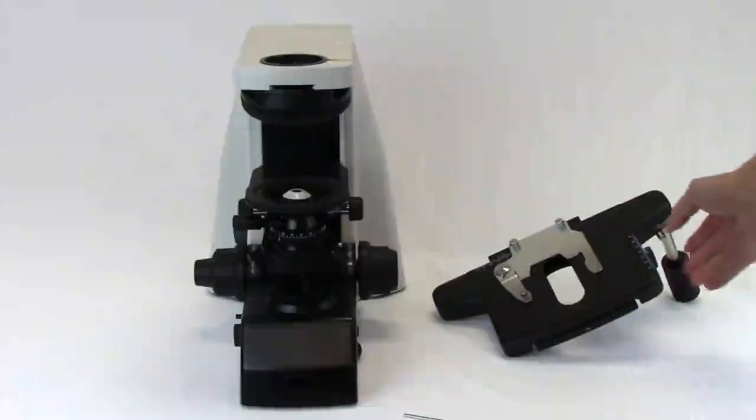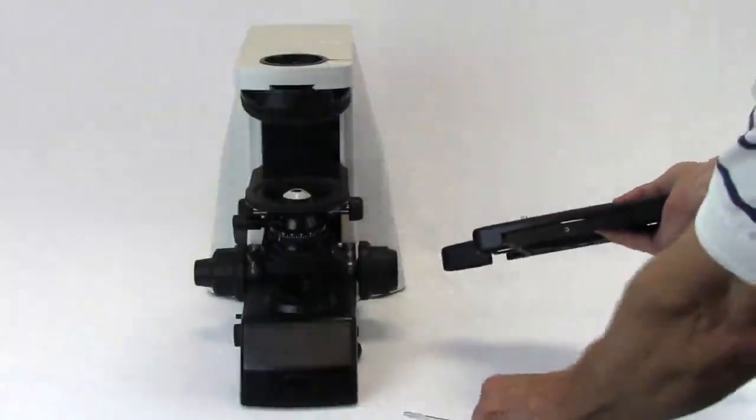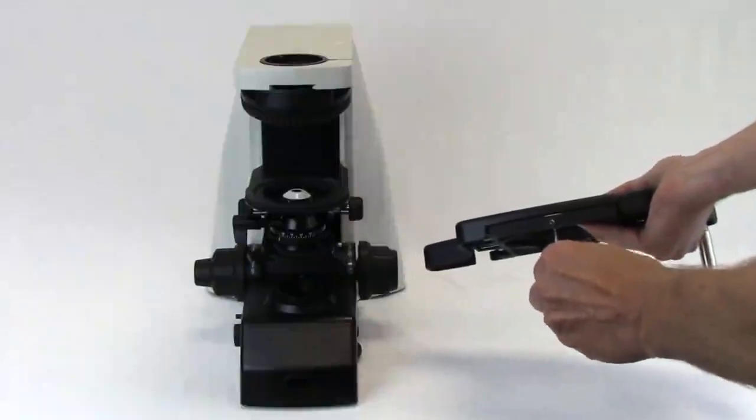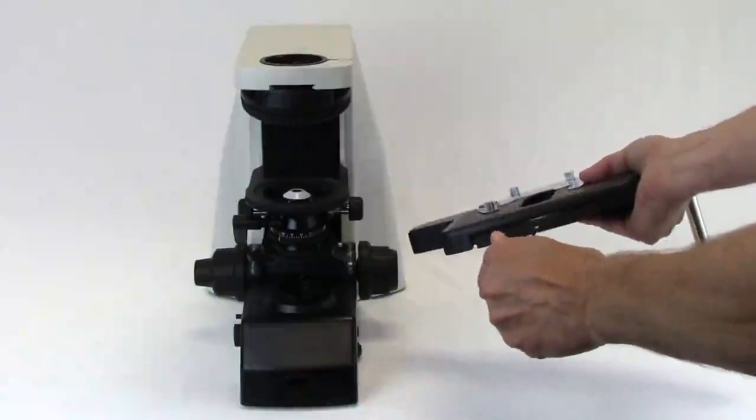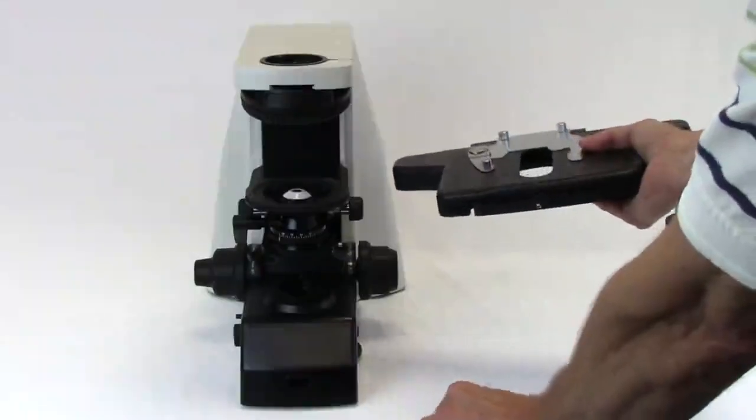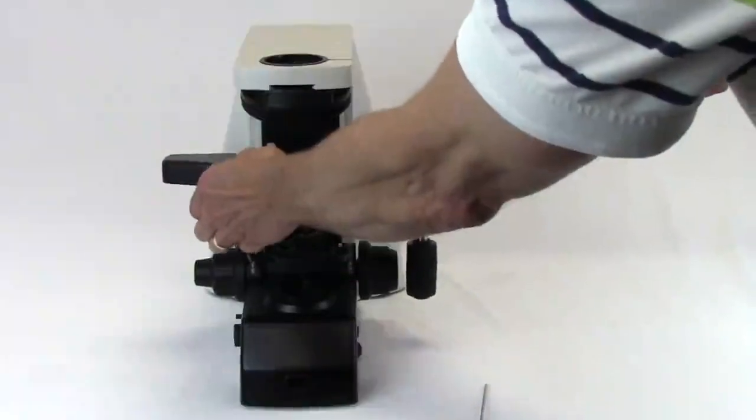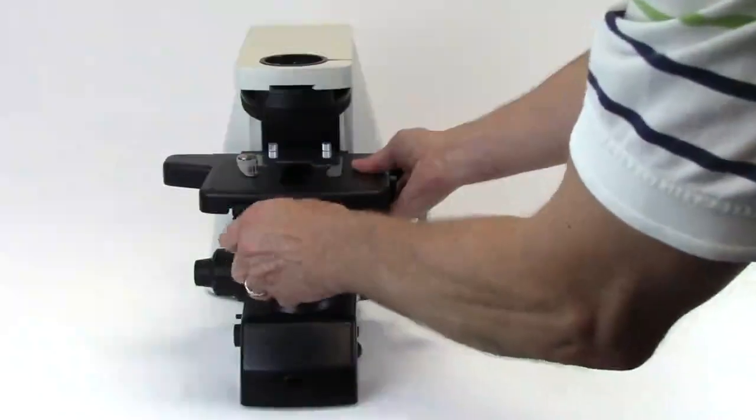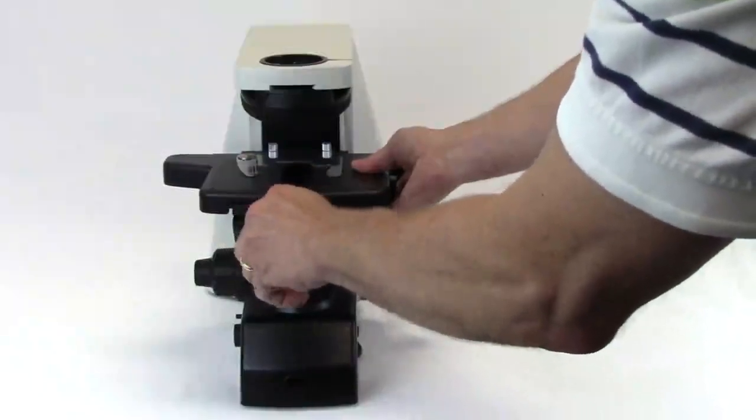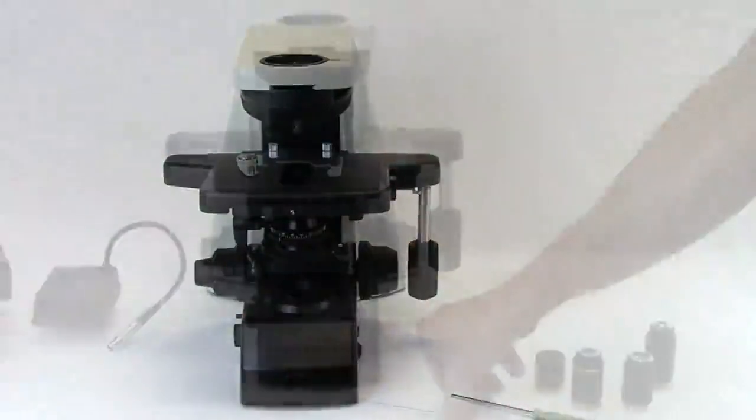Installing the stage. Using the 3mm hex wrench, loosen the lock screw on the front of the stage. Position the XY movement knobs to the right, align the circular mount on the bottom of the stage with the circular bracket on the condenser stage carrier, and set the stage in place so that it is centered over the condenser below. Retighten the lock screw on the front of the stage.